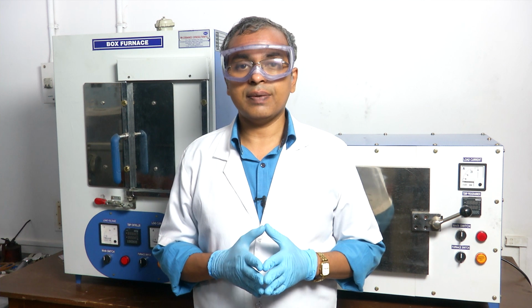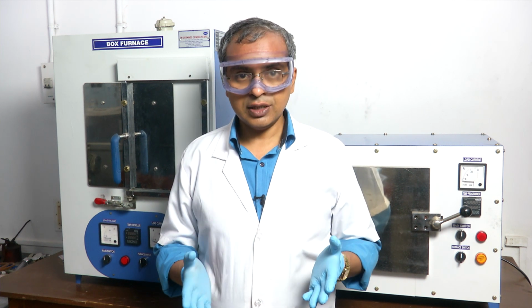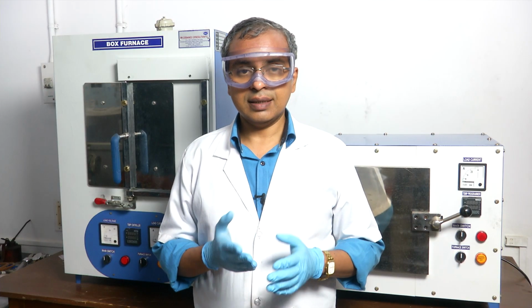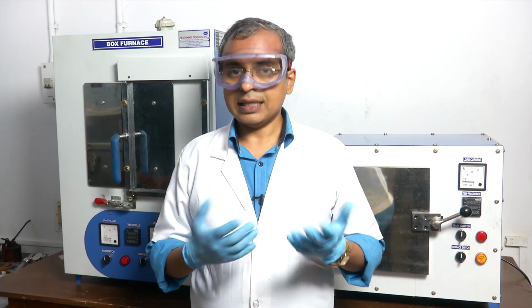So, therefore, invariably labs have some source of water, some arrangement for water in the lab. So, that is the third thing that is very common in the lab. The fourth thing that is very common in labs is gas bottles.